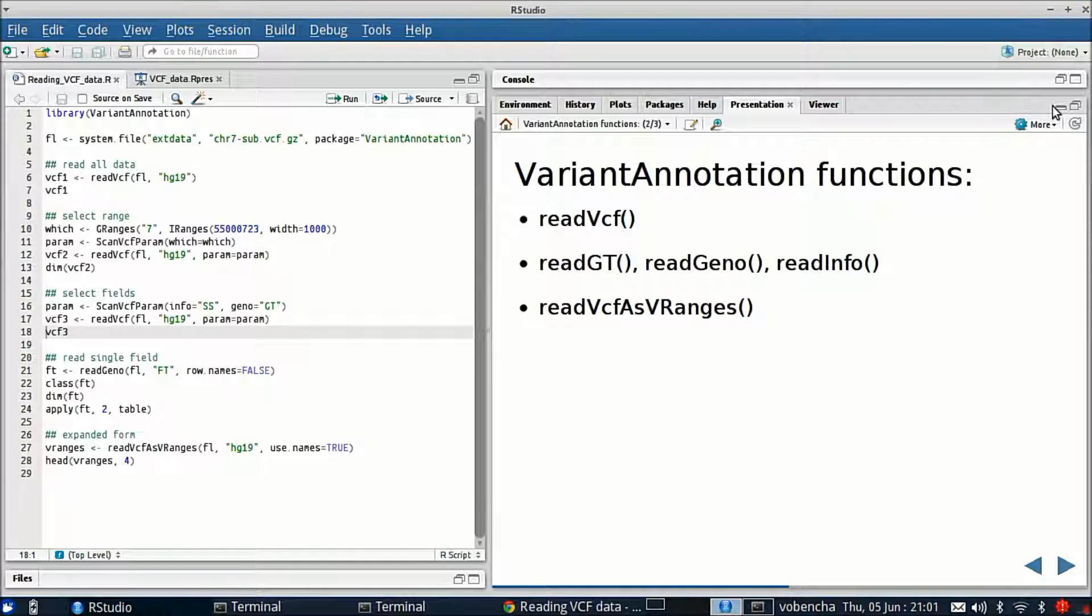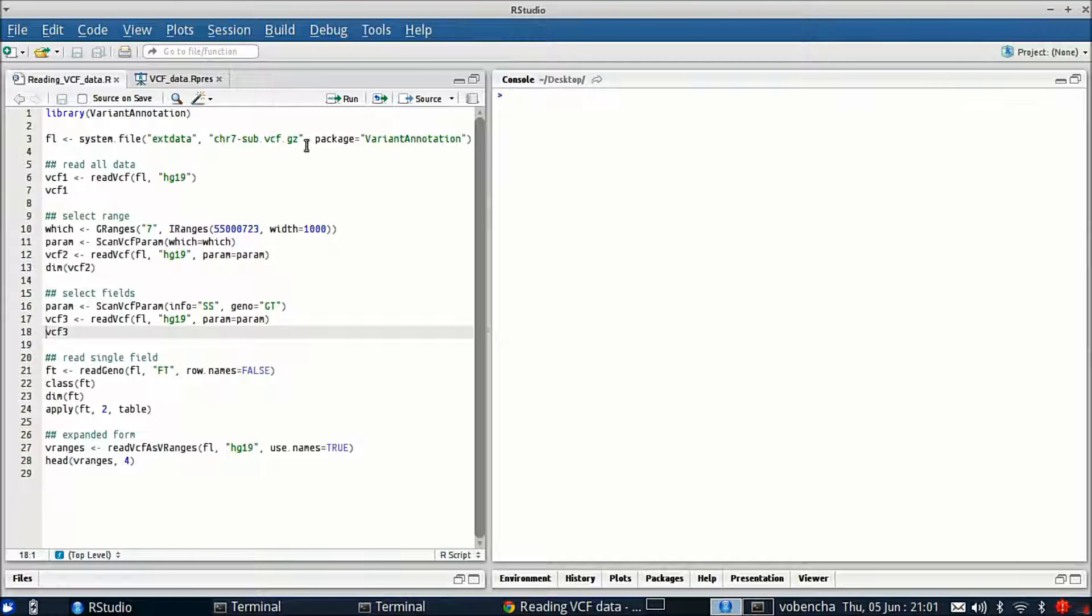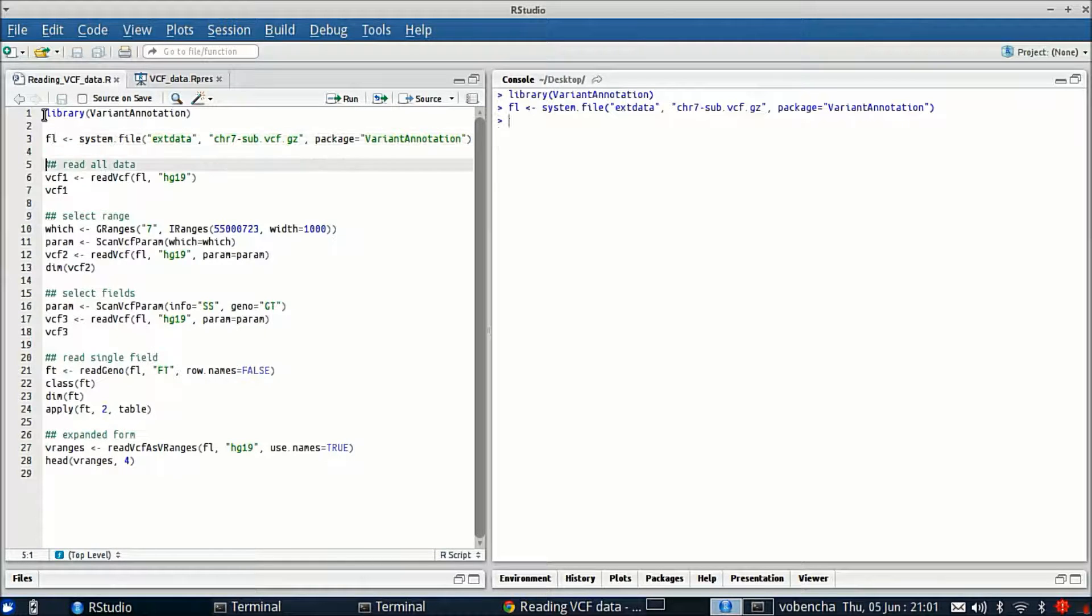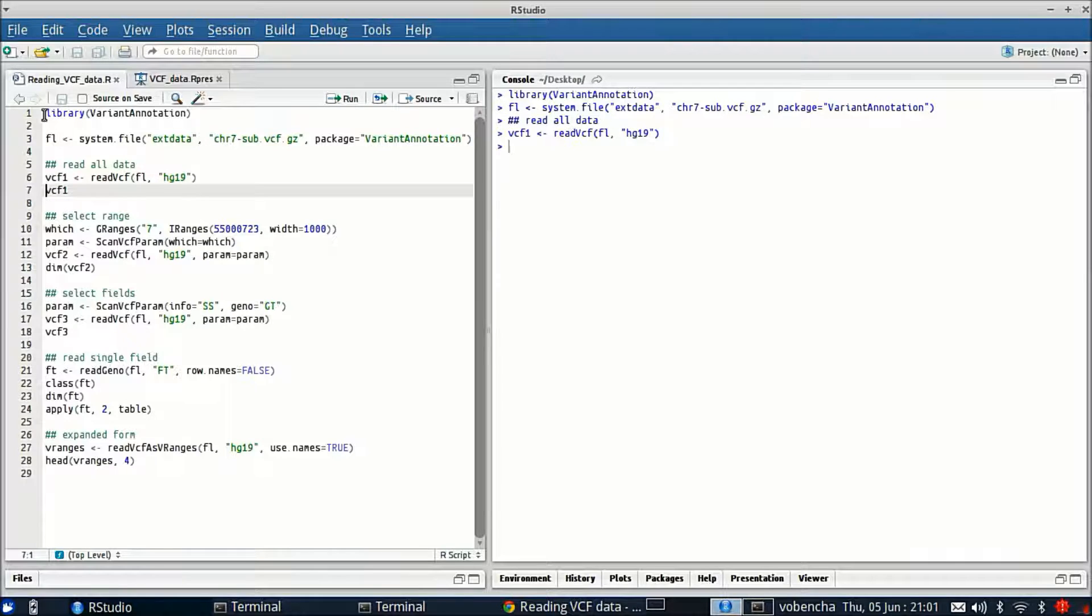So let's start our demo. First we're going to load the variant annotation package and we're going to use some sample data from the same package. Our first call is going to be to ReadVCF with the file and the genome build.